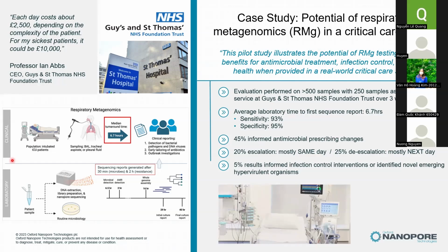Is there any requirement for the distribution of the DNA fragments when I input the sample? I mean, I am going to do whole genome sequencing.